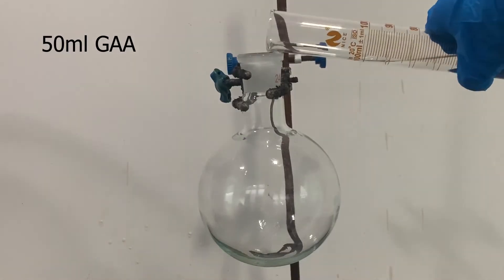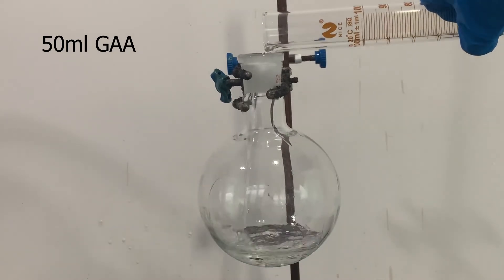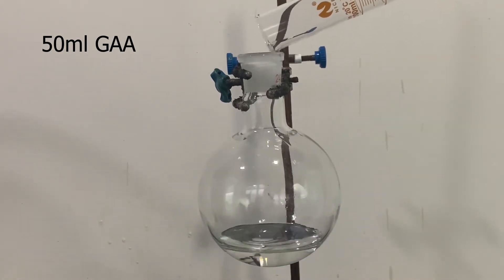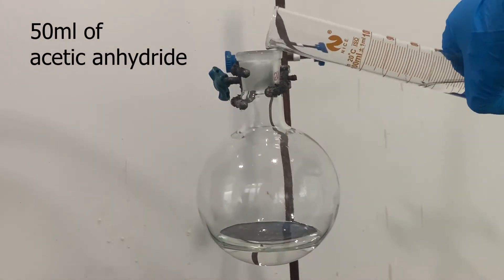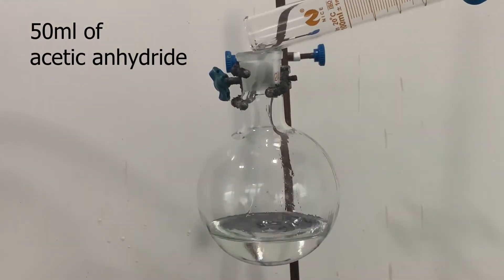To get started, I added 50 ml of glacial acetic acid to a 500 ml round bottom flask. It is then followed by 50 ml of acetic anhydride.